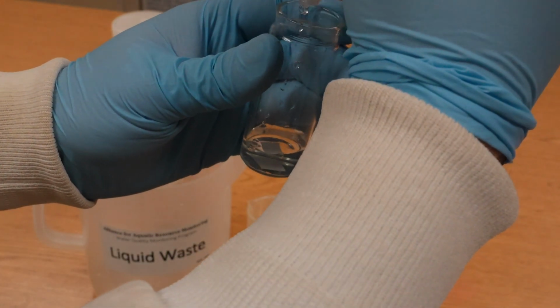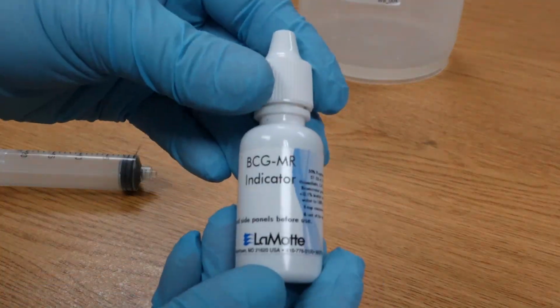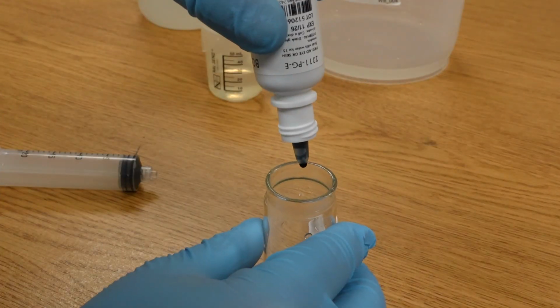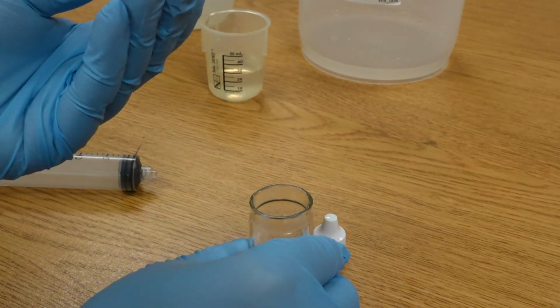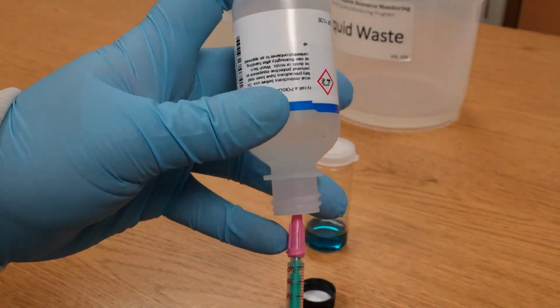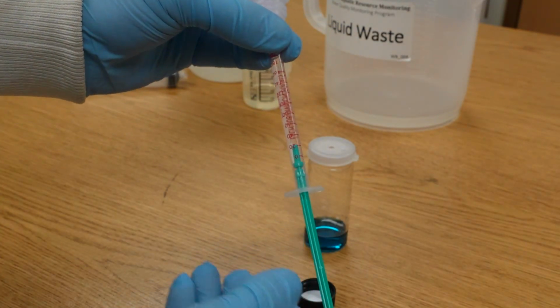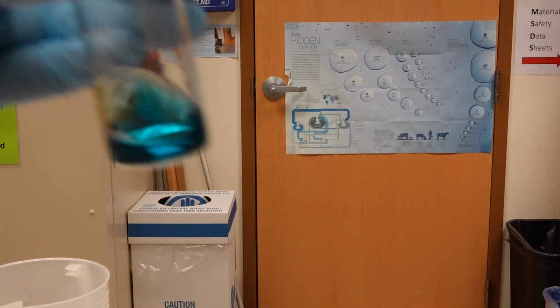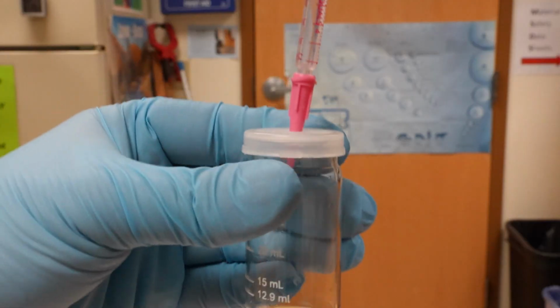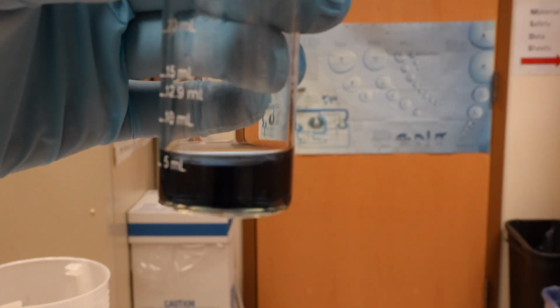Add it to the titration vial. Put in the BCG-MR reagent. Fill the titrator. Add reagent B. And determine the alkalinity reading of your second replicate.